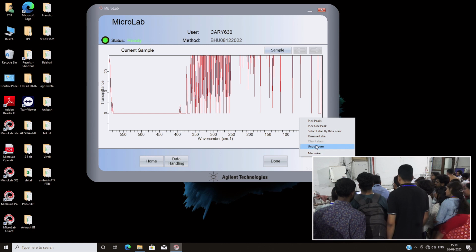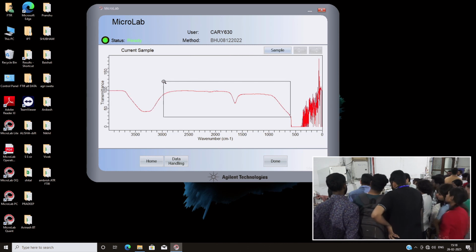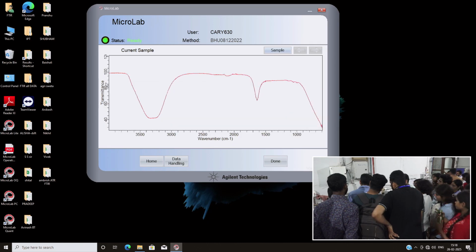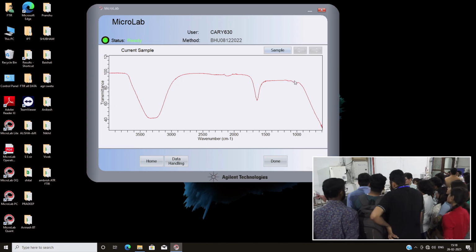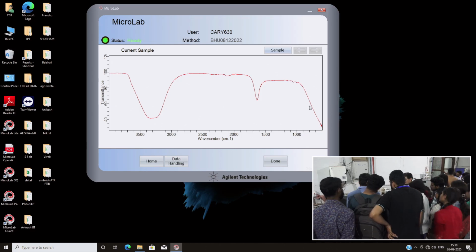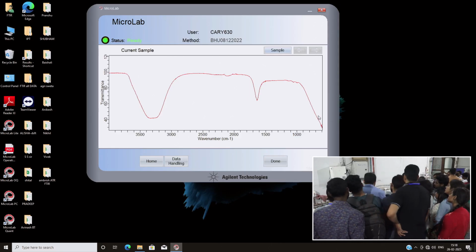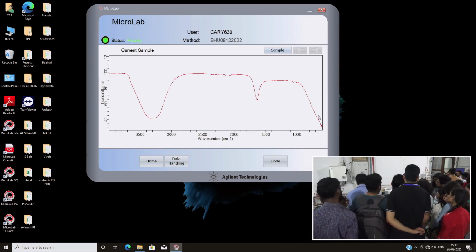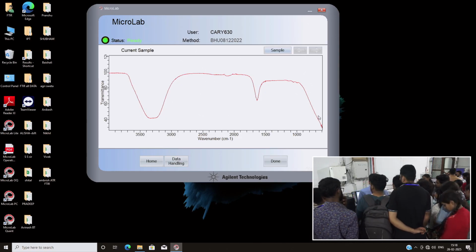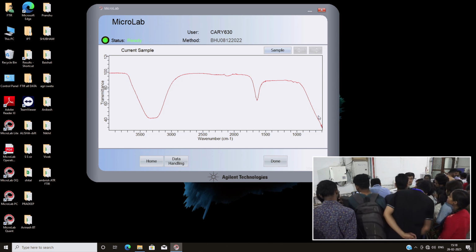And so let's make focus on valid area. Okay. So already the transmittance is getting lower, so the transmittance is poorer due to the prism. Then first measurement finish. This is solvent spectrum. Then next is the measurement of the solution. Difference is if the solute is present or not.